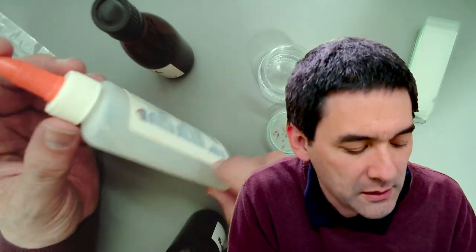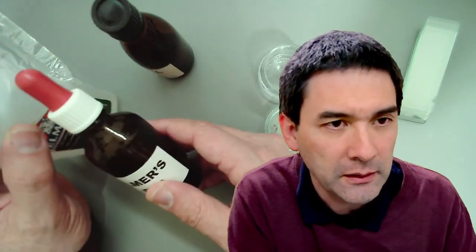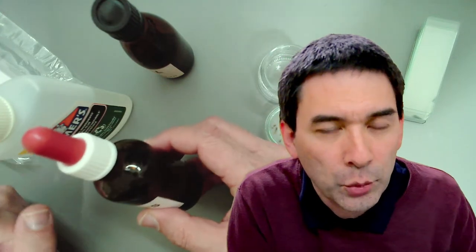The company also makes glues that are white. So what I've done is I've taken some of this and filled it into this bottle here, and I added a little bit of water simply to make it a little bit more liquid.